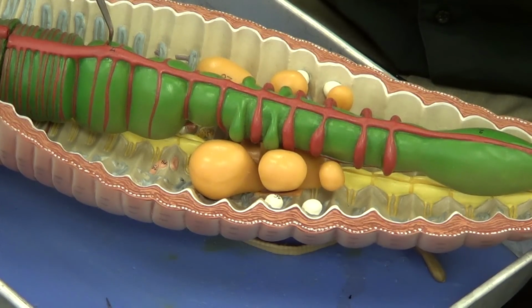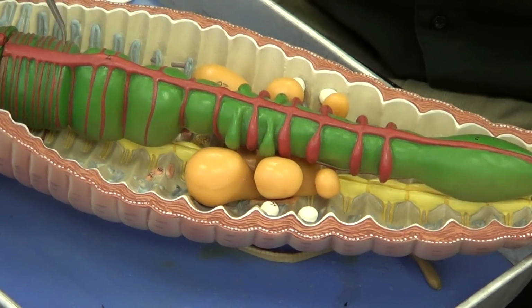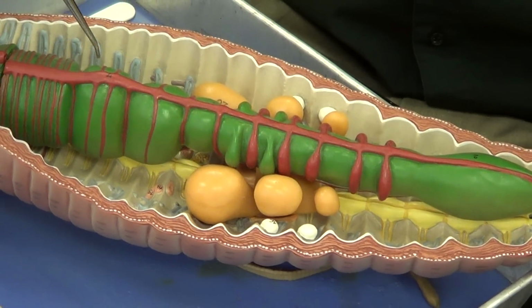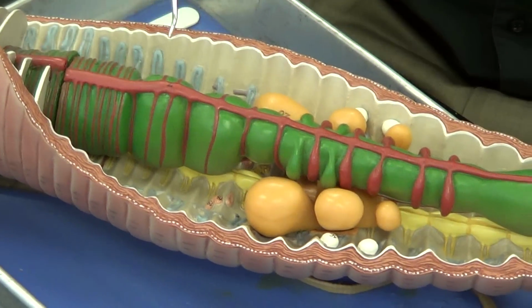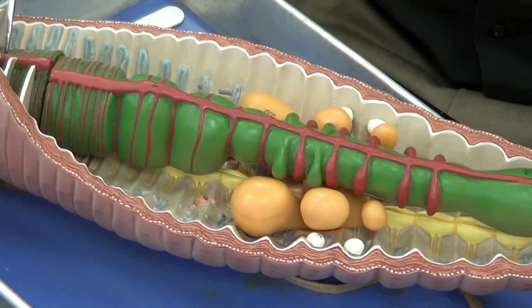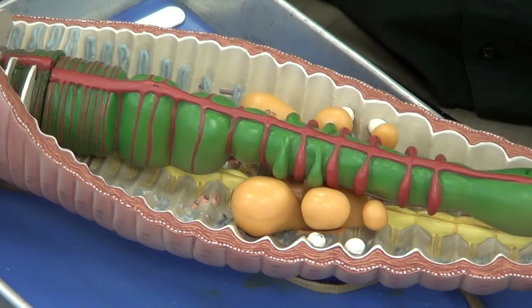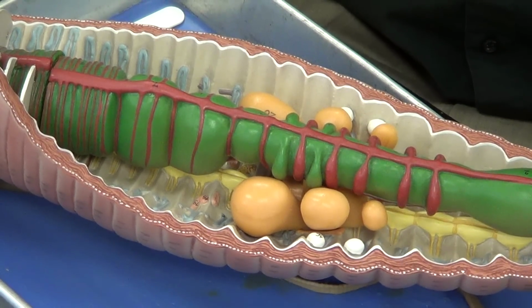So the gizzard is going to do two things. It's going to release digestive enzymes, and it's going to grind the food up. It's going to mix the soil up with the small bits of organic material that this earthworm wants to digest. From there, we're going to go into the last part of the digestive tract, referred to as the intestine. Now the intestine is probably going to make up 70 to 80% of the earthworm.